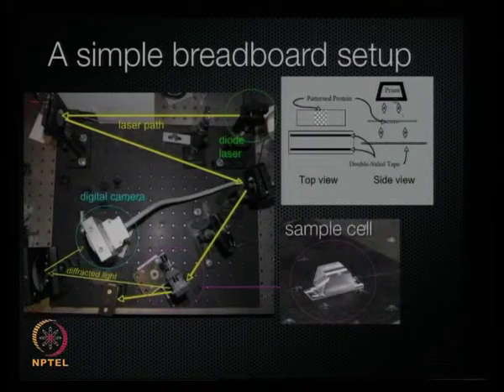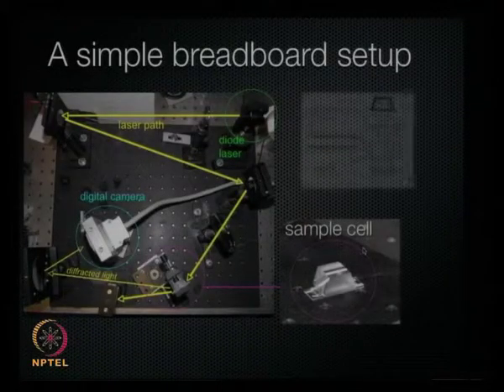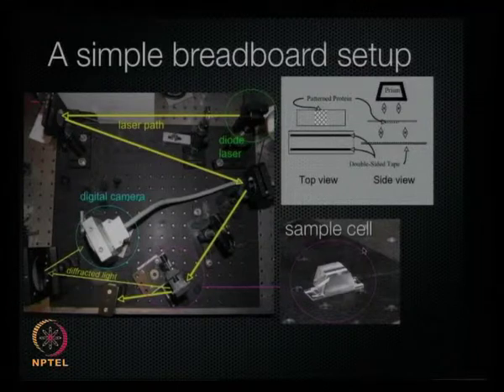Right. And on the other side, we put in a prism. The prism helps to guide the light so that we're under what's called total internal reflection. So the light doesn't go all the way through, it just skims the surface and actually detects the binding on this upper substrate. So it's very simple. So maybe you have a prism, then you have the matching fluid for refractive index correction, then you got the slides which contain the protein. That's right. And then with the light beam, you are initiating the diffraction. Yeah. And with this simple assembly, you can actually measure down to nanograms per milliliter, label-free.